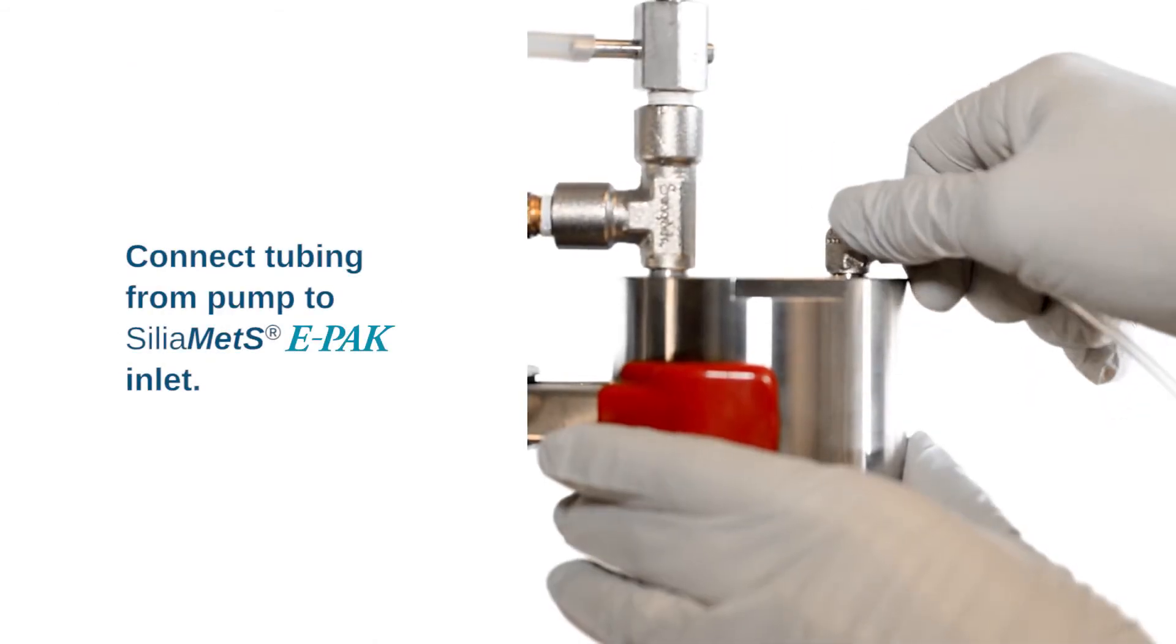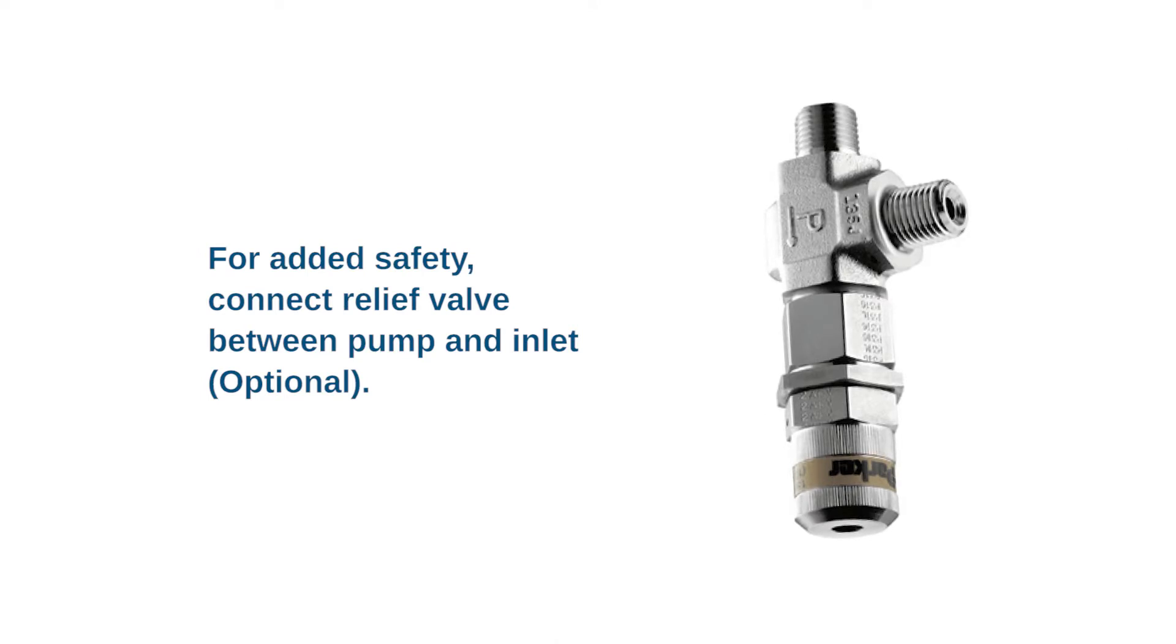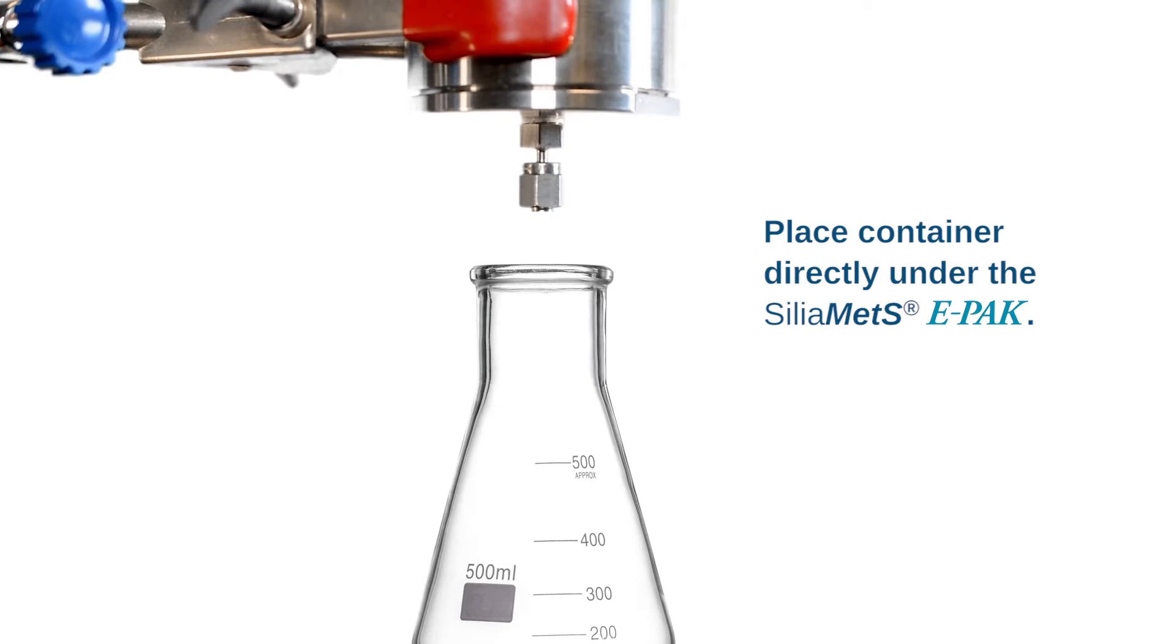Connect tubing from pump to SiliaMet E-PAK inlet. For added safety, connect relief valve between pump and inlet. Place container directly under SiliaMet E-PAK.